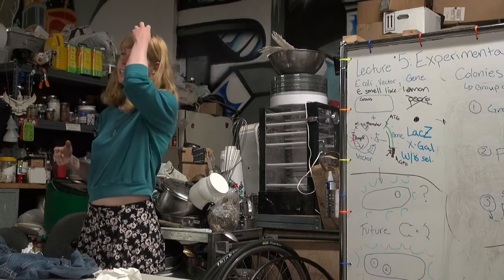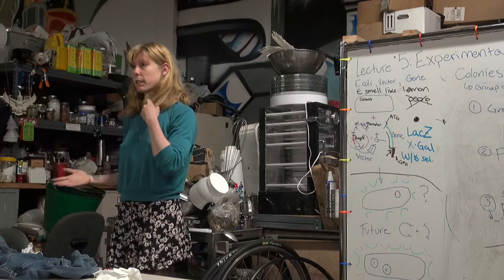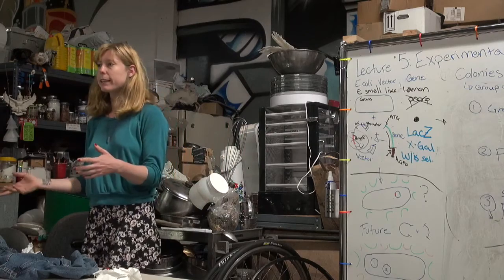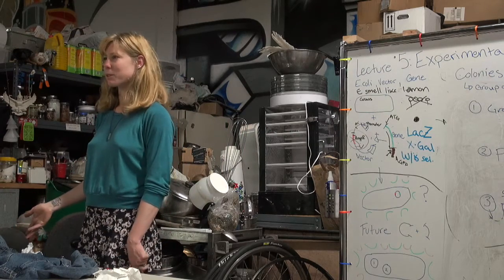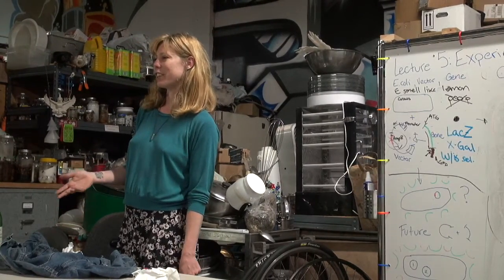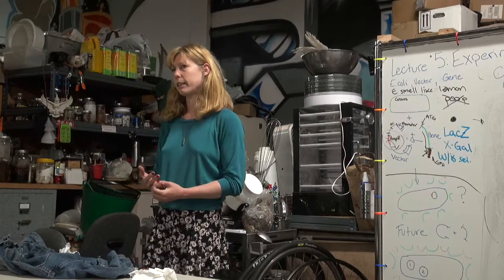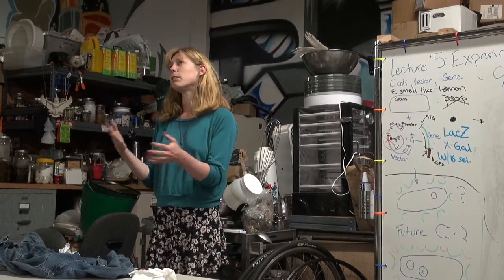The thing is though, for one of the companies I work with, we used to use a service company for building constructs. When I say constructs, I'm talking about vector plus gene of interest, right? And build a variety of them. But you still had to troubleshoot. Sometimes it wouldn't work at all. Sometimes controls wouldn't work and you didn't know why. Right? And so you're like, what changed? And so you buy all new reagents, and it still has some of those human aspects in there. But it is nice for reproducibility to be able to utilize the robot.